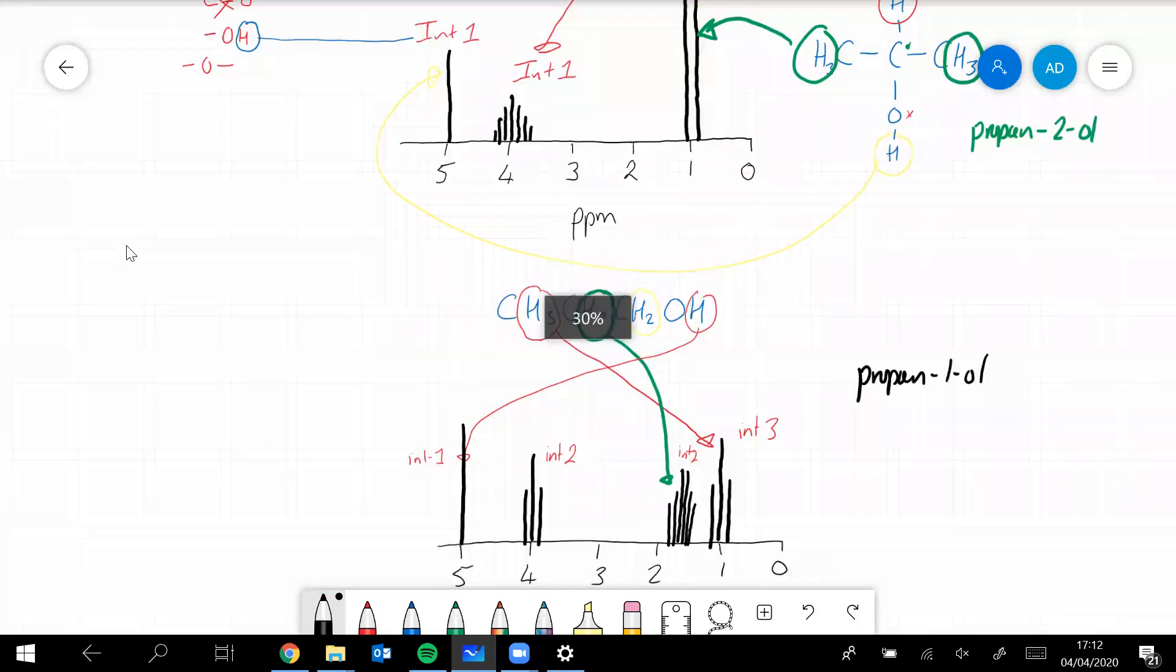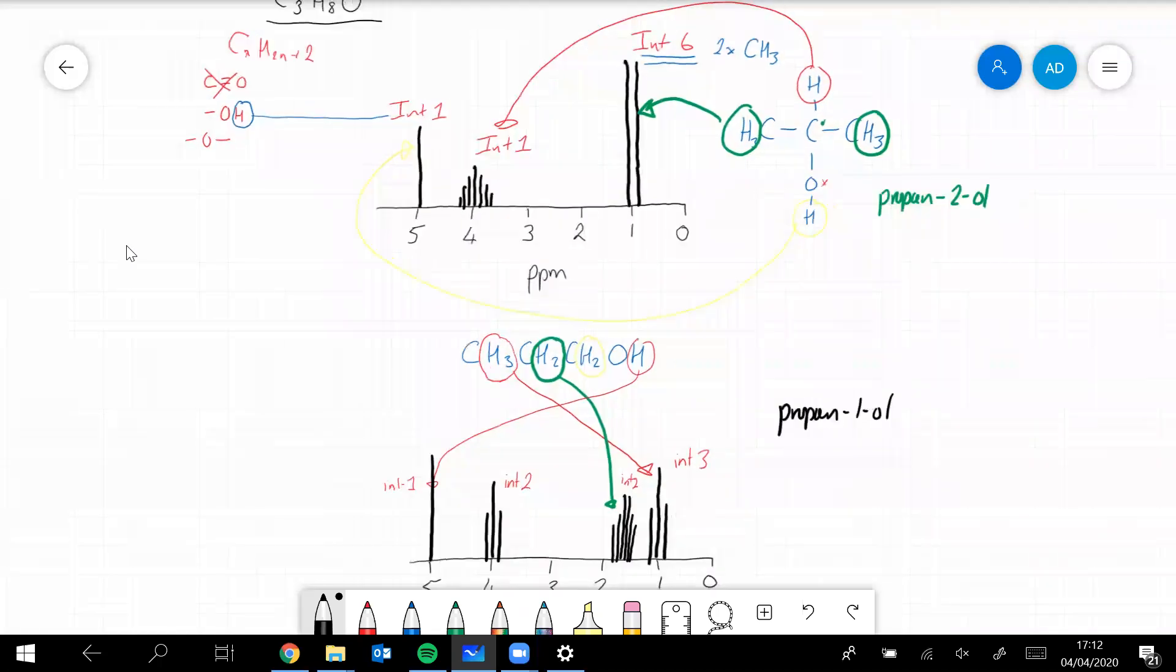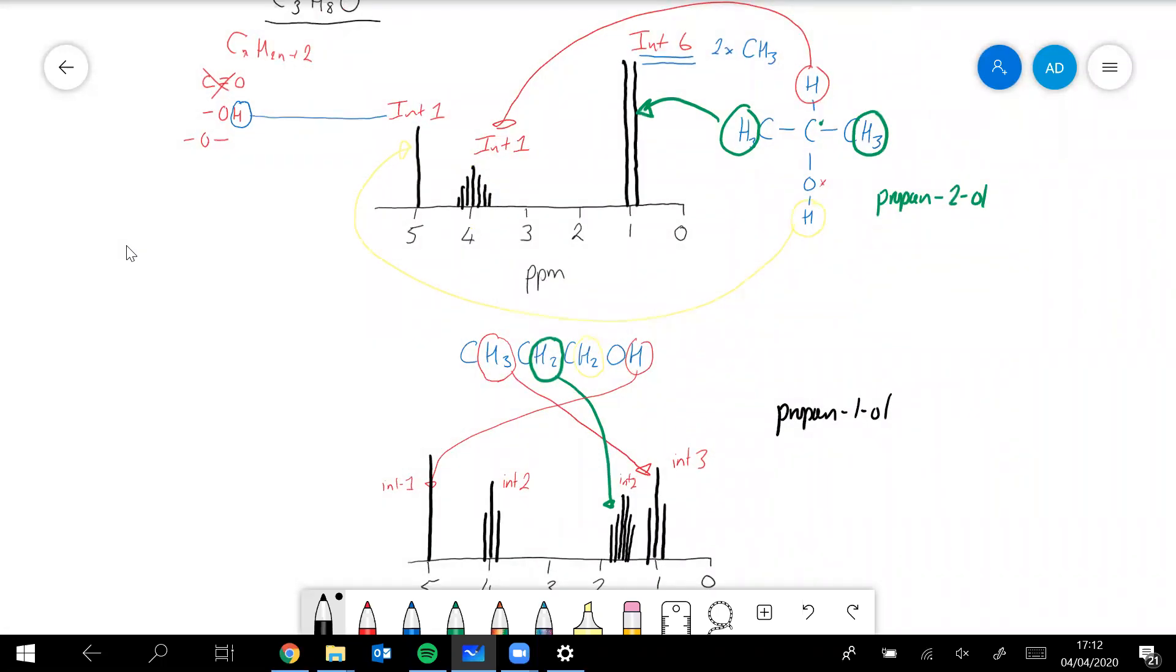If you looked at the infrared spectrum of propan-2-ol and propan-1-ol, they'd be more or less identical. You wouldn't be able to really tell them apart, so here straight away the spectra look very different.